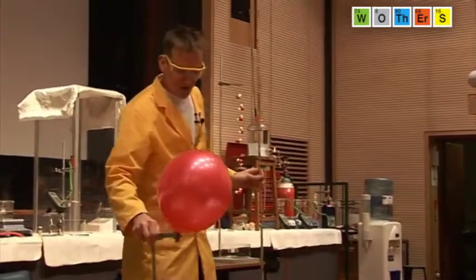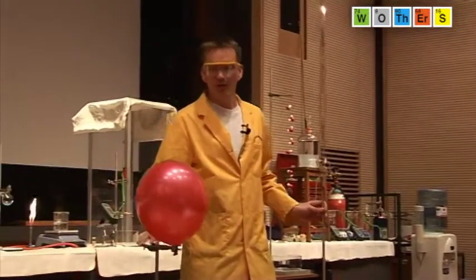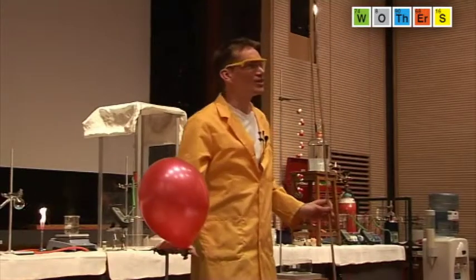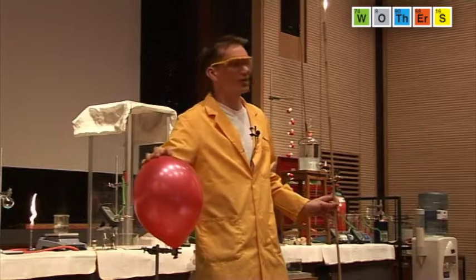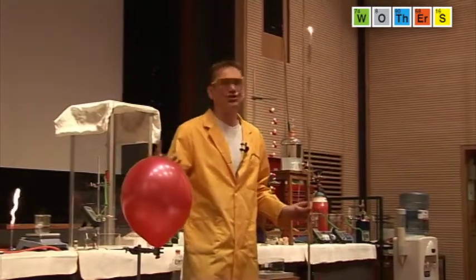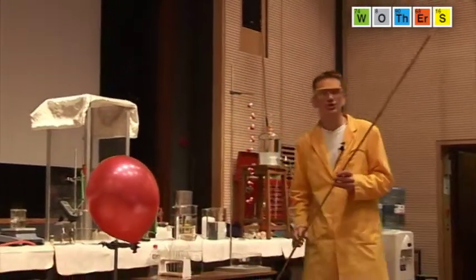Well, here we have another balloon. This balloon is filled with pure oxygen gas. Now, of course, notice this time, this isn't floating up in the air. We've had to tie it to the retort stand here. And this is because oxygen is not lighter than air. It's about the same density. Not surprising, of course, because oxygen is one of the main components in the air. About 20% of the air is oxygen.